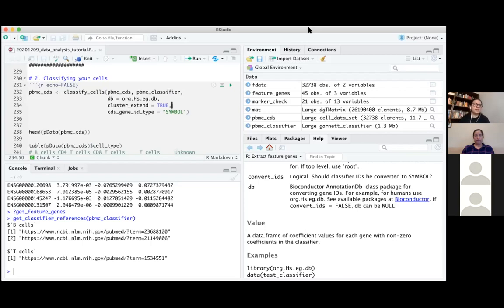So if you have 2 distinct clusters with 2 distinct cell types, but within a cell type there is an unknown component, then if you use the cluster extend type, it will expand the classification to those unknown cells and engulf them into the cell type for that cluster. That's very helpful when you have 10 to 15 different types which are clearly separated in your UMAP or t-SNE plot. But if there's just one blob and very sparse data, then it doesn't help as much.